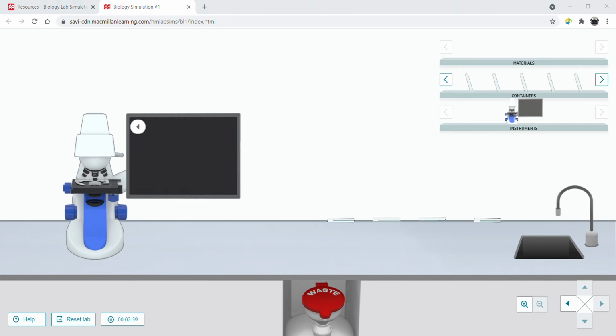That's on page 2. That's an idealized schematic of what's called a compound light microscope. There are many different types. And you see where the eyepieces are. That's where you look through the microscope.